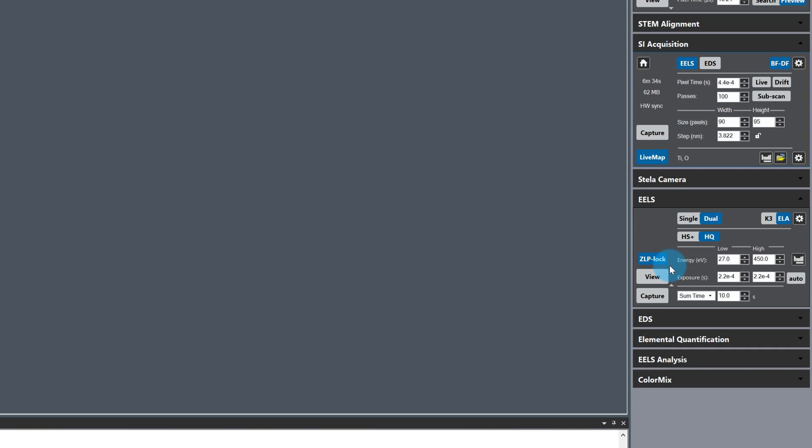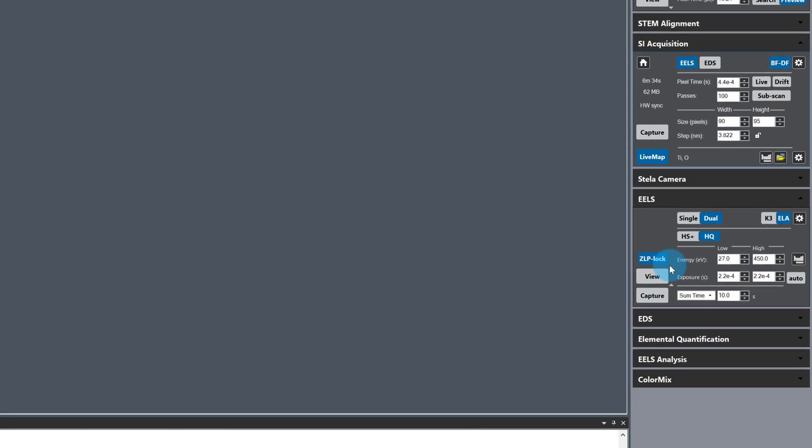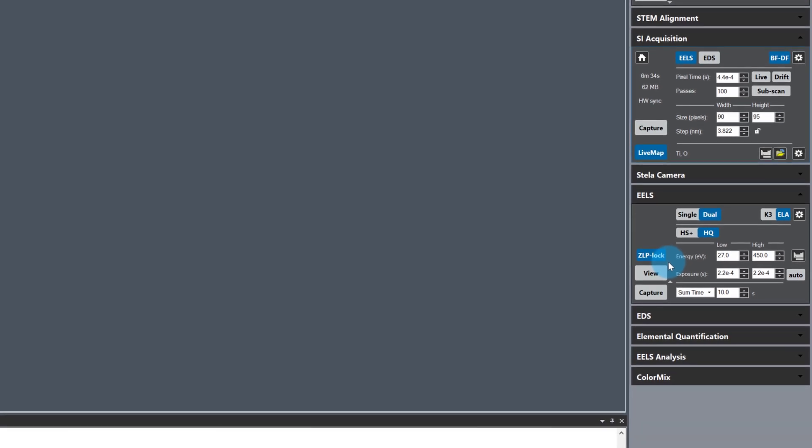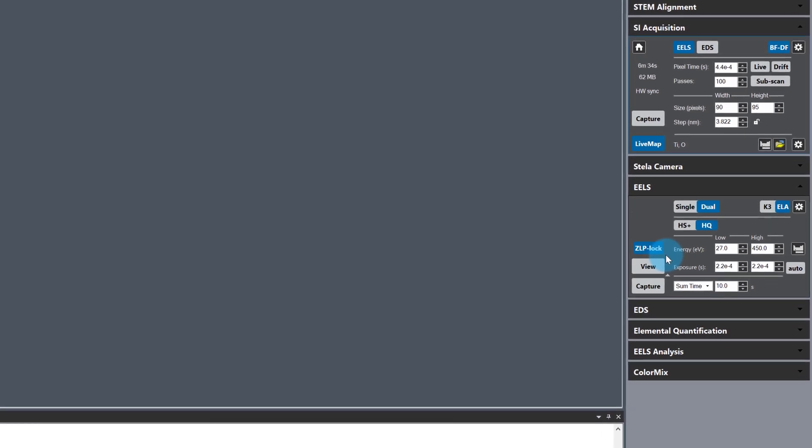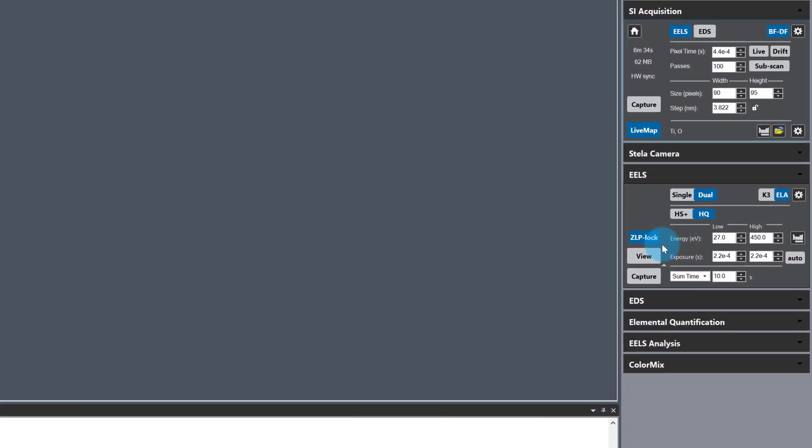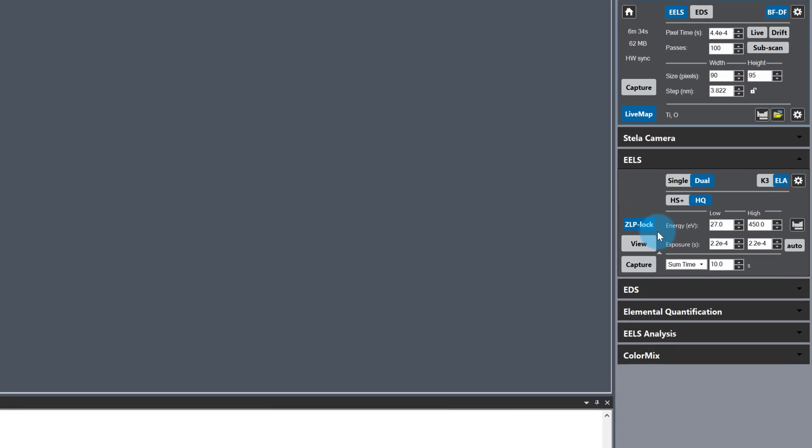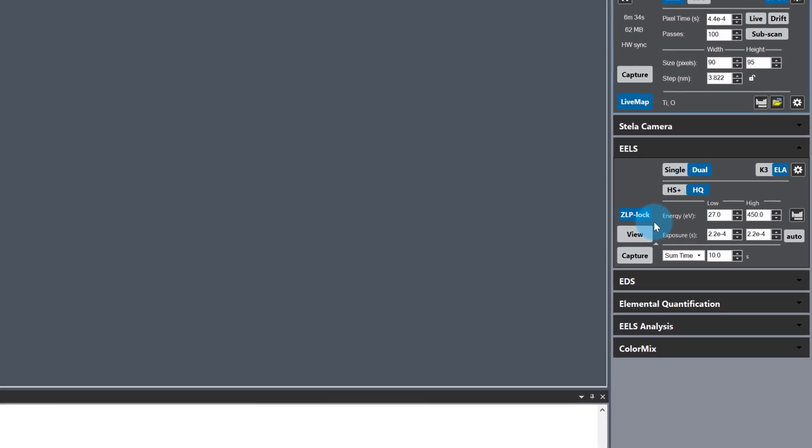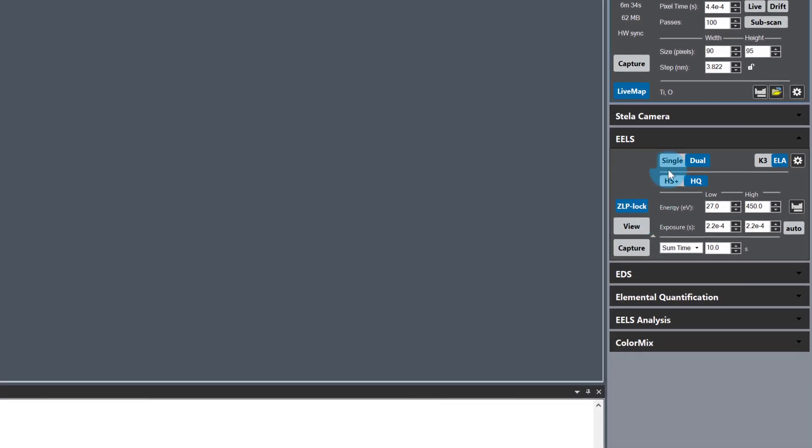In HQ mode, the maximum frame rate for the Stellar camera is 4400 fps. I've set the low loss and high loss exposure times at this frame rate to maximize signal collection efficiency for my experiment.